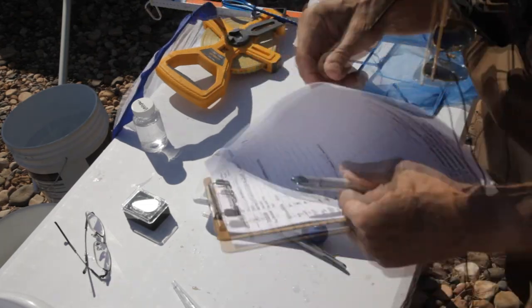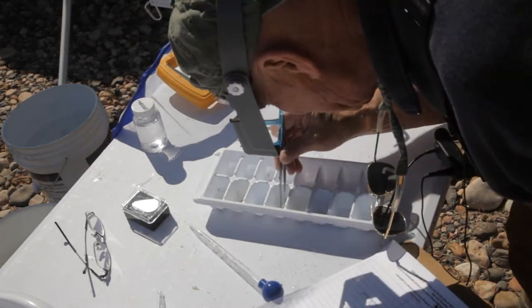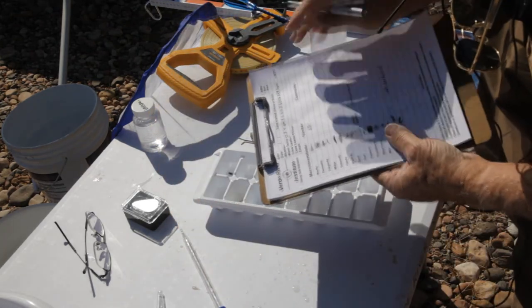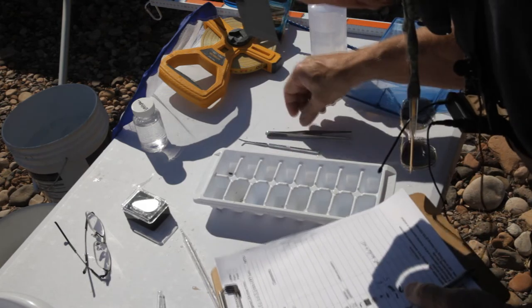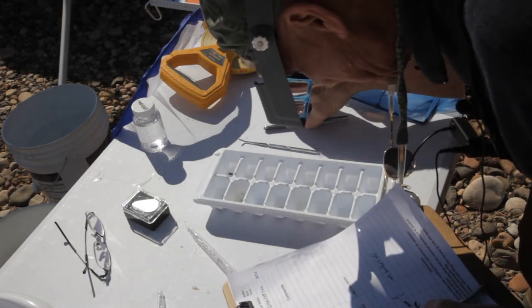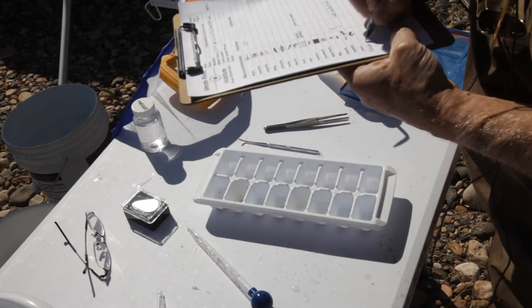Five caddisflies — we'll write that down too. We have one, two, three, four stoneflies — we'll put those down here. We have two, three, four, five black beetles — that's what we'll put here until we know what they are.